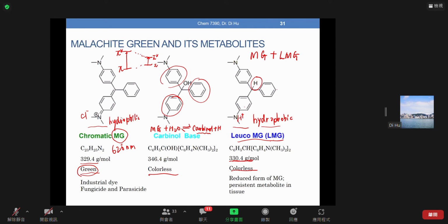Now it's charged, right? It's an ion. Is this cation or anion? It's a cation. So what kind of SPE can we use? We can probably use a strong cation exchanger, right? Because it can be protonated and charged, after extraction, when we want to do the sample cleanup, we can think about a strong cation exchanger. Okay, very good. So that means we load the sample onto the strong cation exchanger.